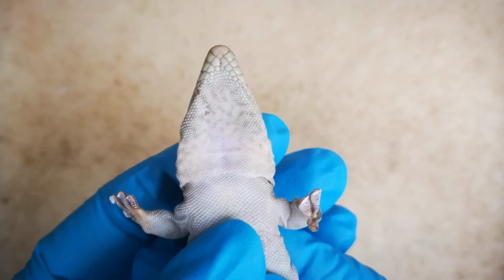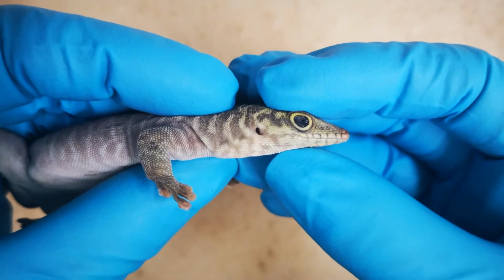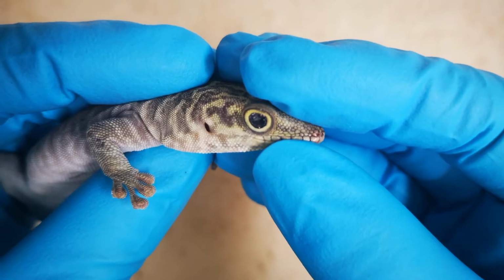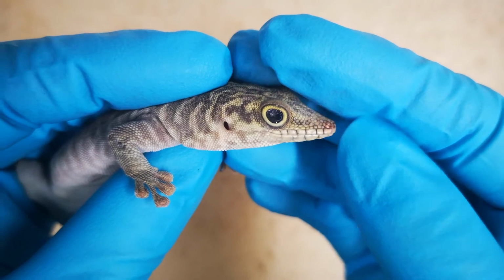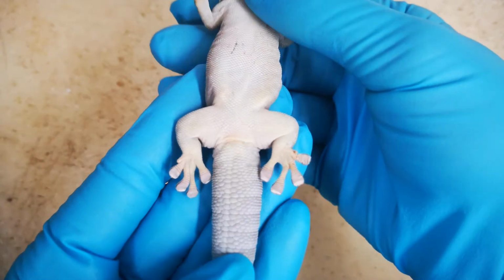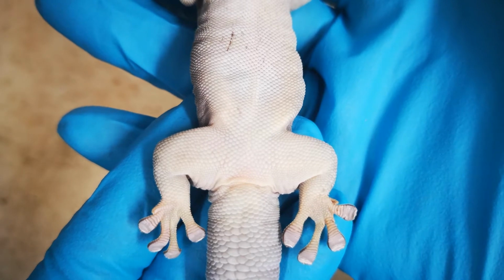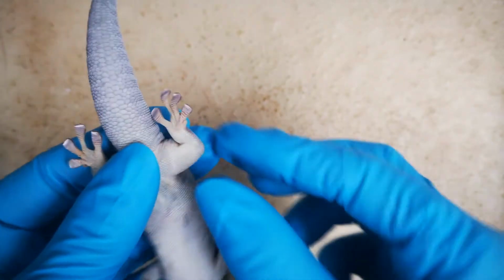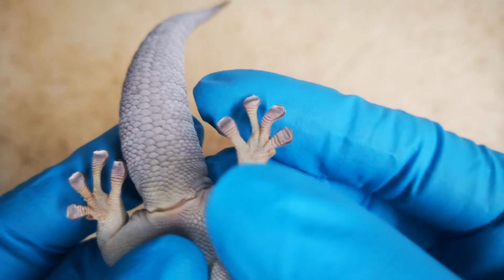Geckos belong to the infraorder Geckota. Most species are covered in small, fine, granular scales, which are often larger on the belly, though some species have very large scales. Along the lips, most species have larger scales. Geckos are perhaps most well known for the pads on their toes. These pads are divided into rows, called lamellae. Each lamella is covered in microscopically finely divided hairs that allow surface adhesion through electrostatic interactions, or possibly van der Waals forces. Phelsuma do not have claws, but many other gecko species do.